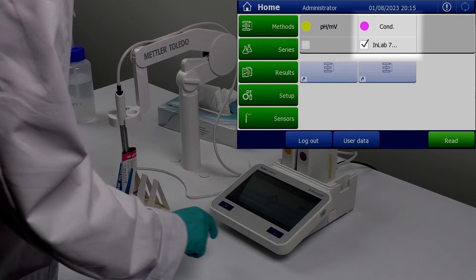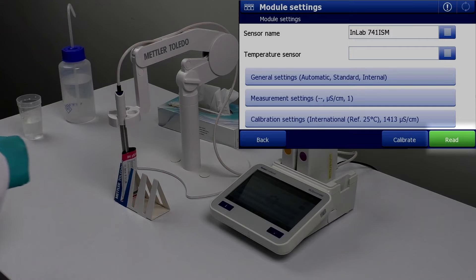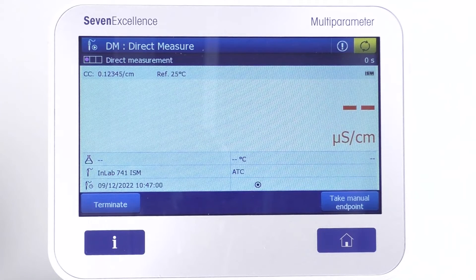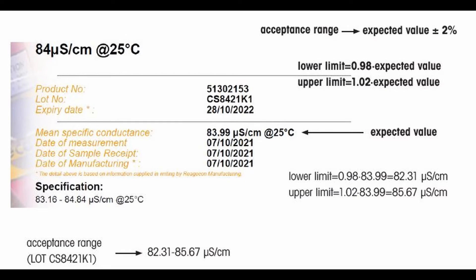Rinse the sensor with deionized water and dab it with a tissue, then immerse the sensor in the conductivity standard. On the 7 Excellence meter, select the conductivity module, which displays the module settings for the verification. Press the 'Read' button to start the verification. Once done, you can see a value on the meter that you need to compare with the expected value.